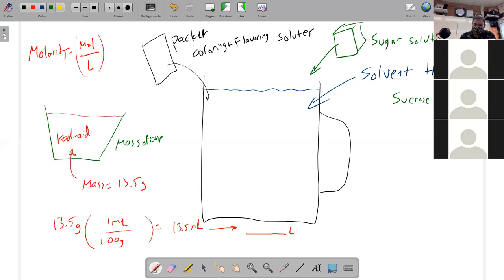So a smarter thing to do is take a cup with sugar, so here's sugar in a cup, and you weigh the sugar in the cup. Let's say the sugar and the cup has a mass of like 15.2 grams. You want to take some sugar out of that cup and add it to the Kool-Aid in small portions and stir it up until you think you've got an appropriate amount of sugar.